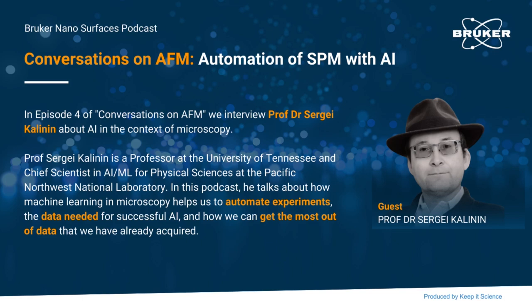So each time I hear that someone proposes to use some form of very data-intensive machine learning, starting from scratch, to run the microscopes, I have certain doubts whether it is possible, because usually microscopy or science is not associated with big data in the classical definition. A second key aspect is that there are scenarios where big data is the right approach. Everything related to medical imaging, anything related to sufficiently well-established workflows, for example in the semiconductor industry, are the cases where big data is important.